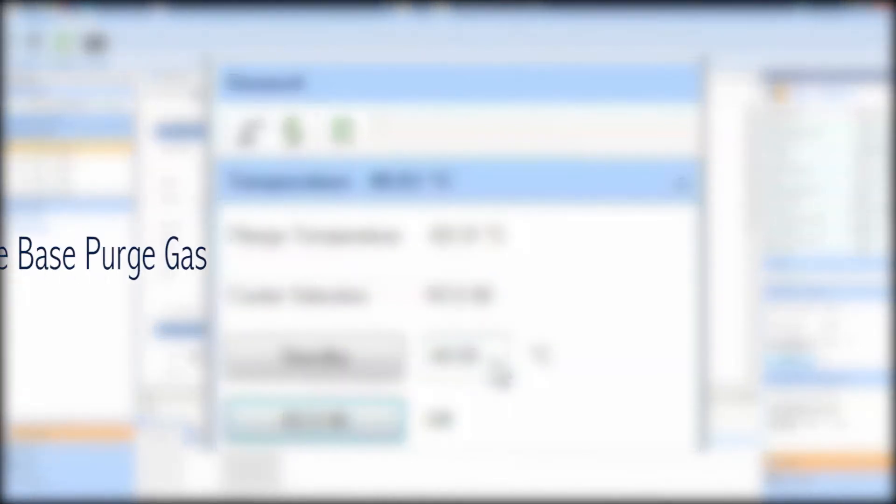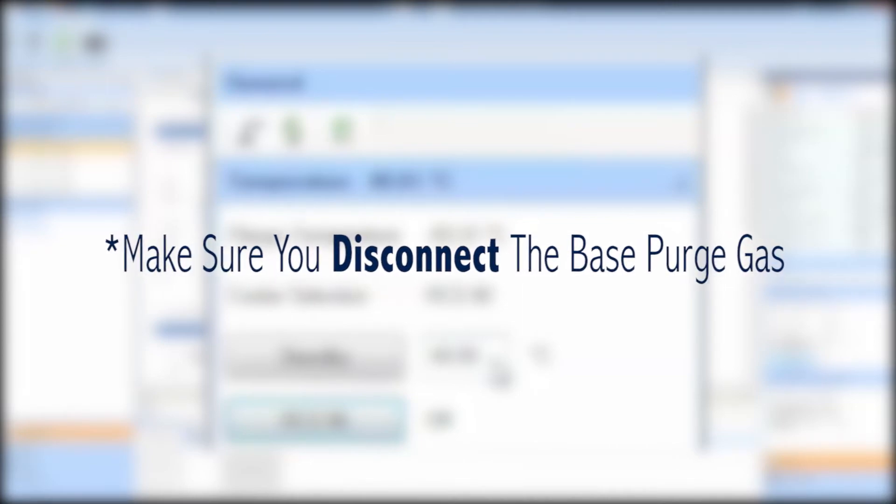Before you disconnect the RCS, make sure you disconnect the base purge gas.